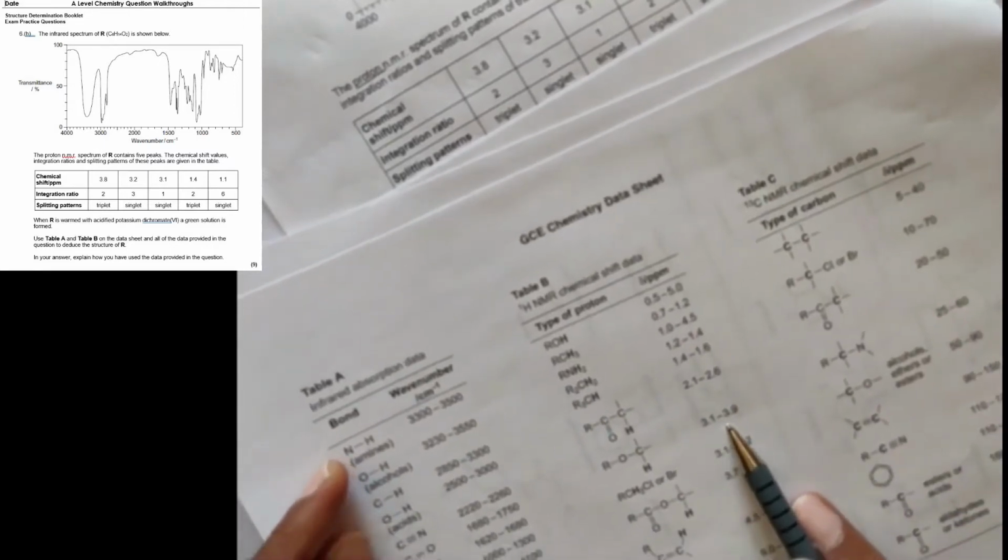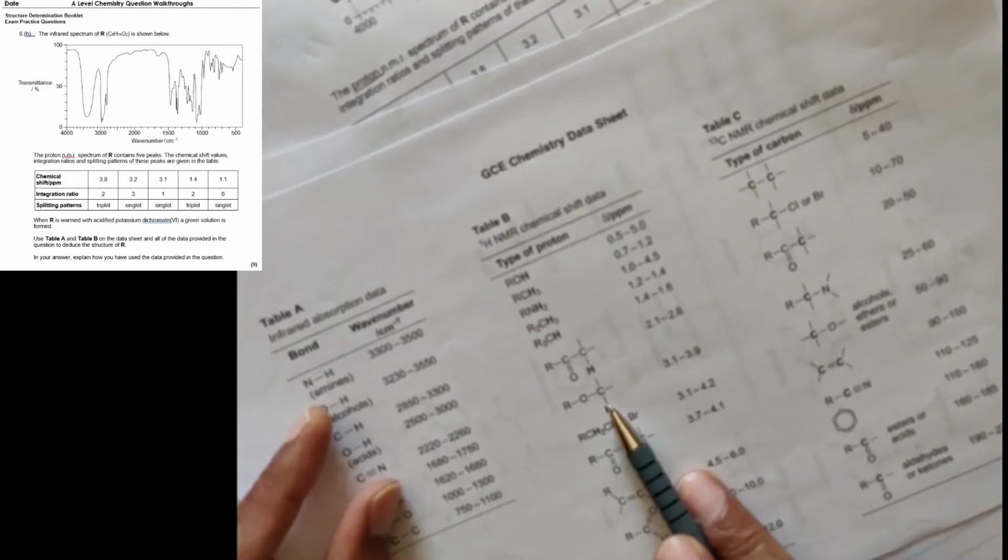So 3.8, it can't be that because we don't have a nitrogen in our molecule. 3.8, yeah, that could be that. It can't be that because we don't have chlorines and bromines. 3.8, it can't be that because it's not an ester. An ester wouldn't be oxidized by the potassium dichromate. So 3.8 looks like that fragment. Okay, so I'm going to draw that fragment here.